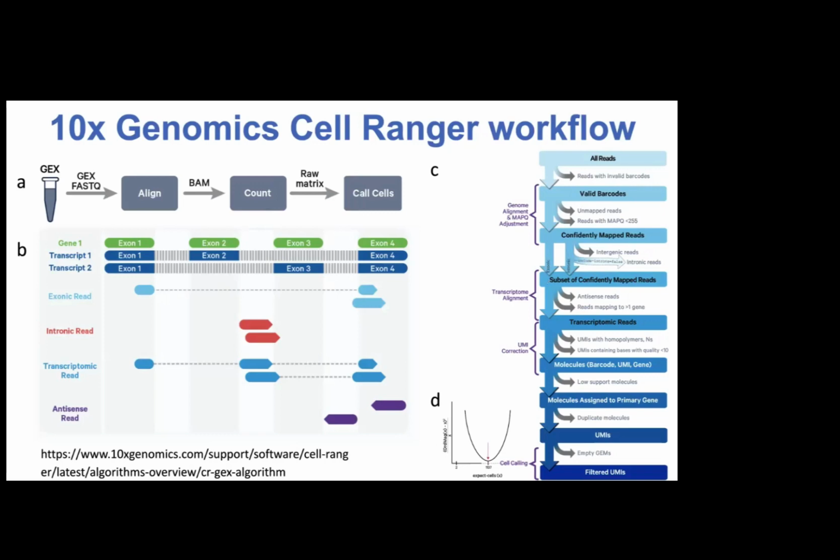They also dismiss anything that isn't uniquely mapped, if I understand it correctly. And they always map against a gene. It's not on a transcript level, only on a gene level, because you don't have enough reads to be confident about transcript-level stuff. So now we have a read that aligned somewhere on a gene sequence, is uniquely mapped, has good read quality, and has a barcode.